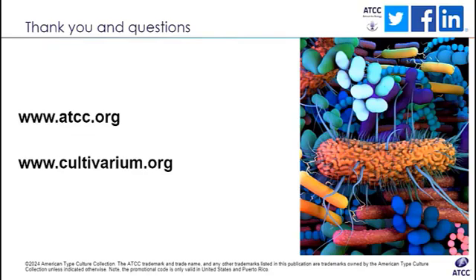Here's another one. You mentioned during the presentation that there's extra information that you host in the portal. Can you clarify what that is? Apart from all the experimental and computational data that I showed you during the webinar, we also host information about sequencing of the strain and methylation patterns for some organisms. We also have publications.